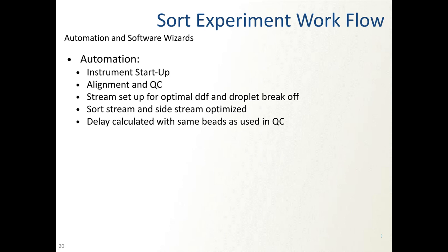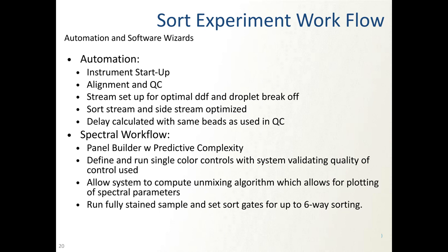And that's basically the biggest deal of sorting. I mean, if your delay is off, everything goes to crap. And we have confidence that for the first time, that full level of automation, in one click, is really working great. And now there's a couple other instruments that have that too, and it's made flow sorting a much easier process. So next, let's take a look at the actual spectral workflow.